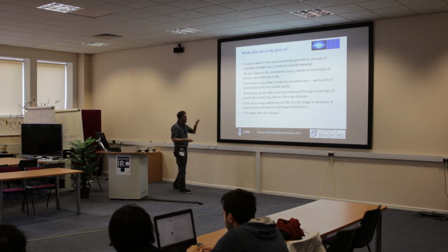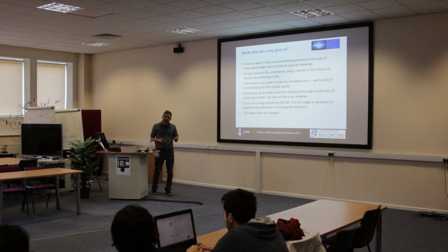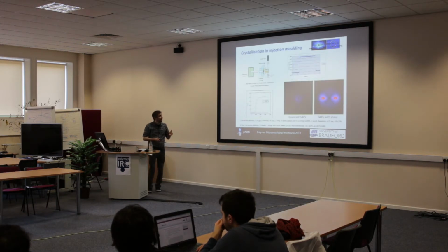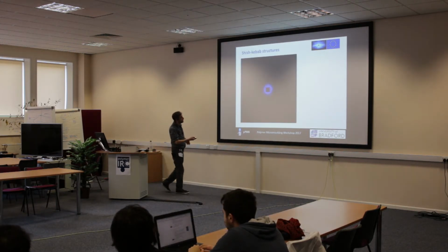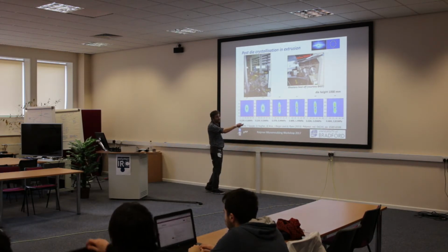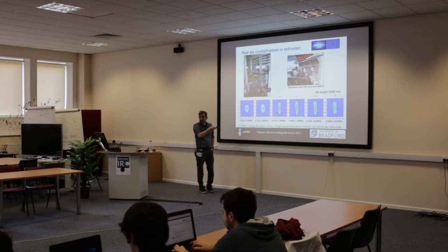One of the limitations of our machine upstairs is the camera is not massive. The orientation, because of the nature of scattering, if you can see 90 degrees of your image, a quadrant of your image, then you've got every measurement that you can get out. The rest are simply repeats. Basically you don't need all of that image because the top and the bottom are mirrored and the sides are mirrored. So to get a full measurement out, you just need one quadrant of your results.